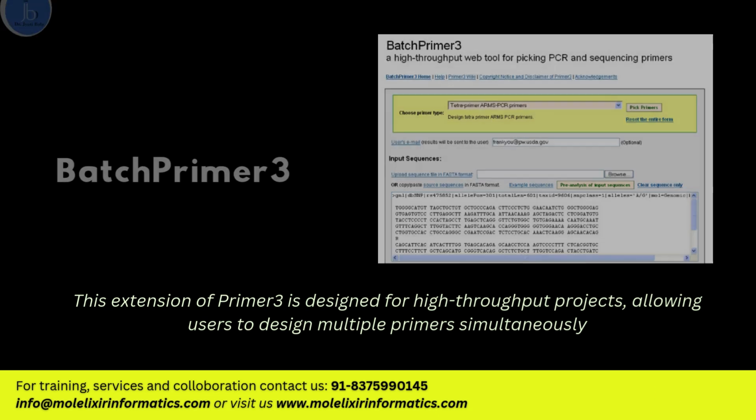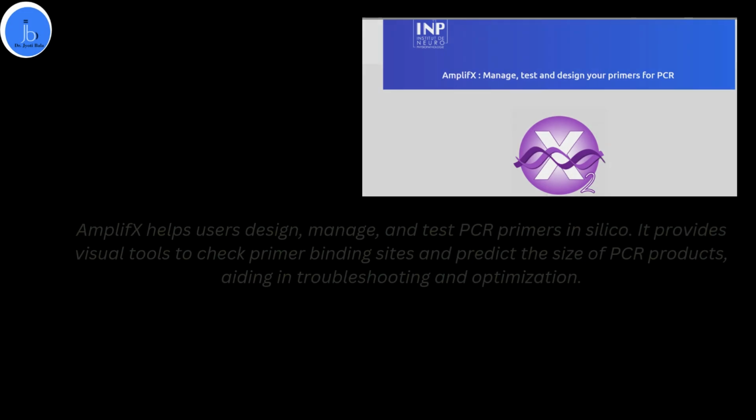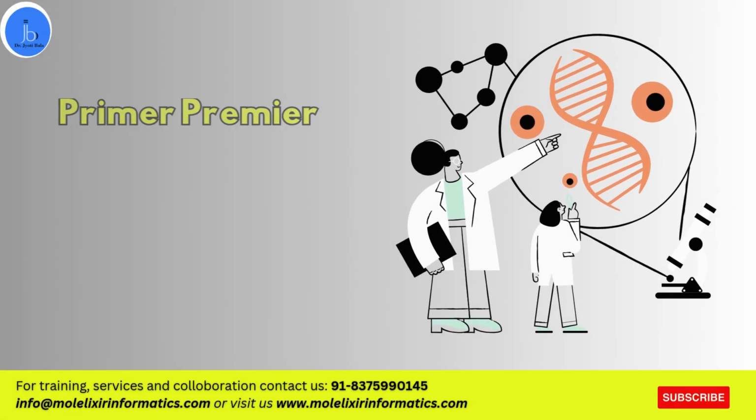The next one is Amplifx. This one is used for visualization and management of PCR primers. Amplifx helps users design, manage, and test PCR primers in silico. This provides a visual tool to check primer binding sites and predict the size of the PCR product, aiding in troubleshooting and optimization.